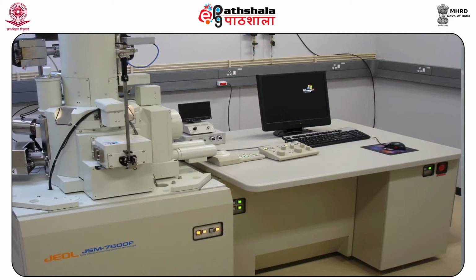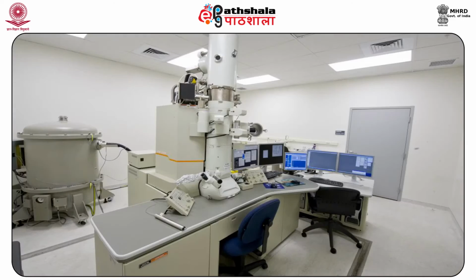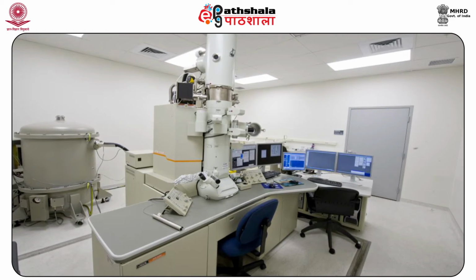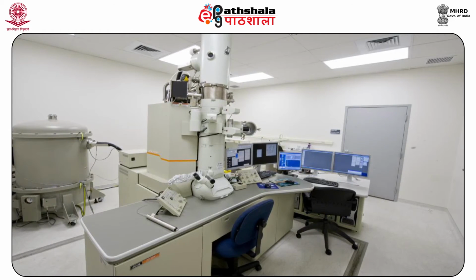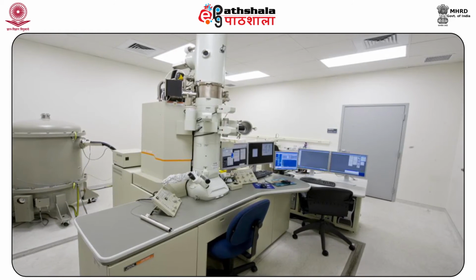The control is infinitely finer over here. And because electrons behave like waves of much smaller wavelength, it has resulted in much more magnification, higher resolution, and greater depth of focus.